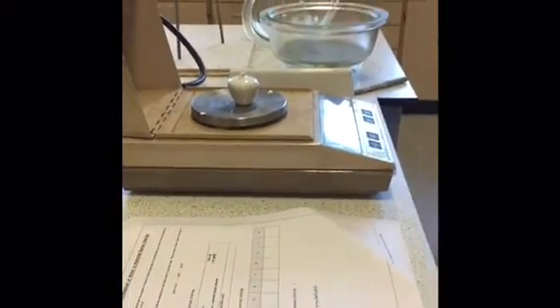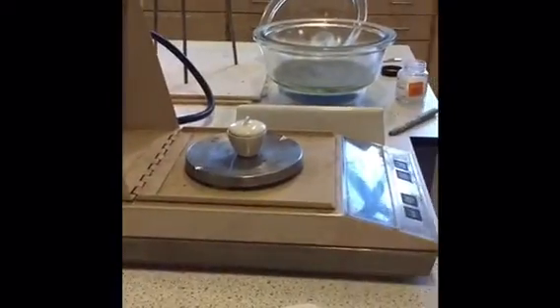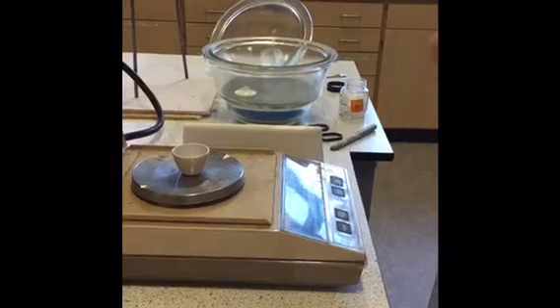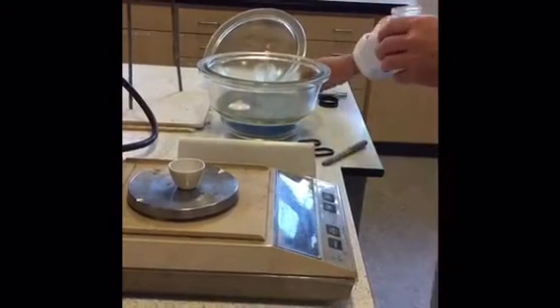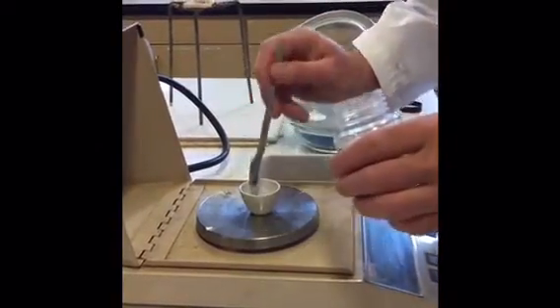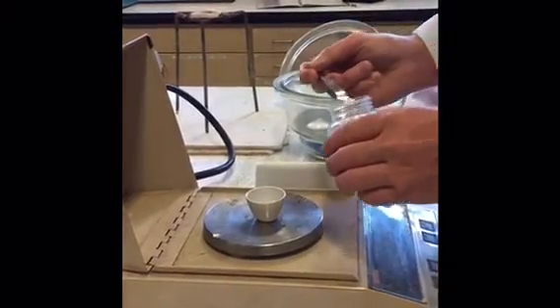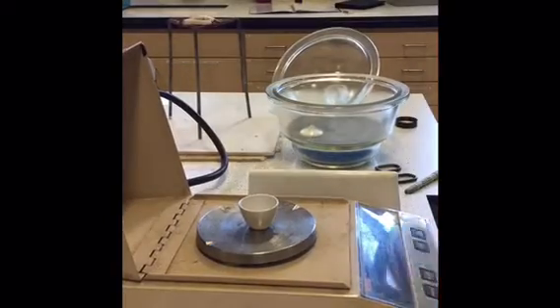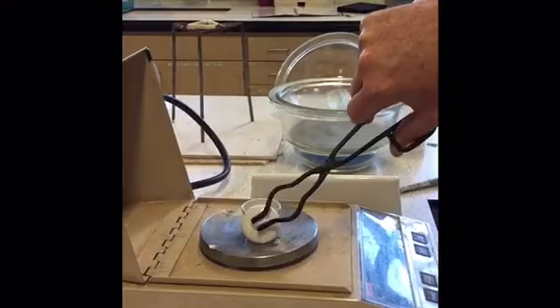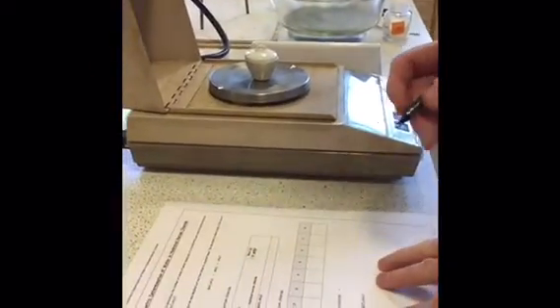And now I'm going to add some of the hydrated barium chloride. So now what I want to do is add approximately 2 or 3 grams of the hydrated barium chloride to the crucible. So take the lid off. I haven't zeroed the balance, but obviously it's dropped now. It says 11 point, well, it's just almost exactly 12. So I'll add some barium chloride till we get up to about 14. That's 12.8. 13.6, just a wee bit more. So that's reading 14.3. I'll put the lid back on. And record the total weight of the crucible plus our barium chloride, which is 22.269.